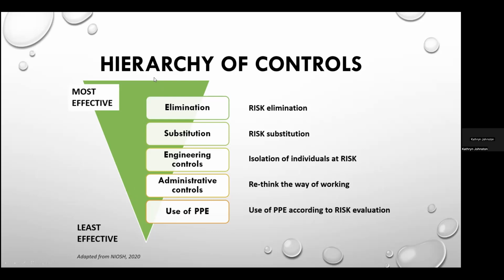So it's not just for doctors and nurses, it's for people in every area. So this hierarchy of controls could be applied with different elements, the same, like elimination, substitution, all of these, but specifically aligned for laboratory or for a maintenance department or a bioengineering department. So it could be applied in all those settings.